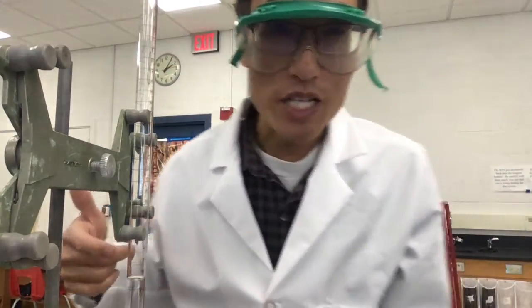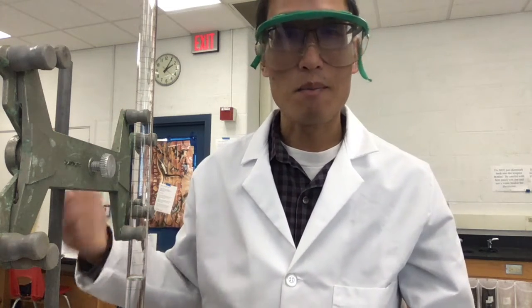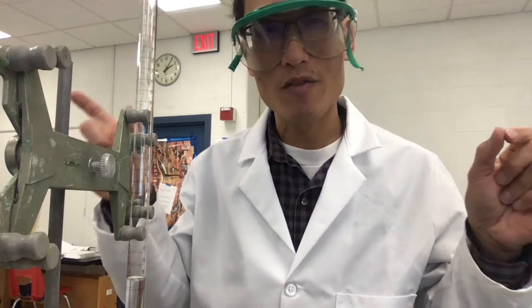In the simulation, they go the other way. They start pink and you go clear. So you can do it either way. Go pink to clear, or you can start clear and go pink. But once you have all your numbers, then you do your calculations and figure out the stoichiometry of the moles of stuff.